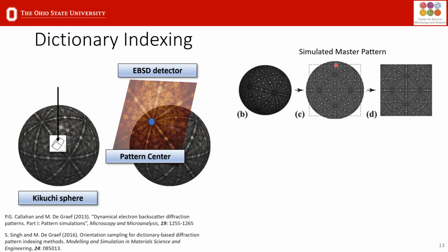The first component performs a Monte Carlo simulation where it calculates the angles of the backscatter electrons and their associated energy. So as the electrons move through the sample, they will lose a certain amount of energy. So the Monte Carlo simulation calculates those energy losses and the angle at which these backscatter electrons will come from the sample. And then it solves the second component.